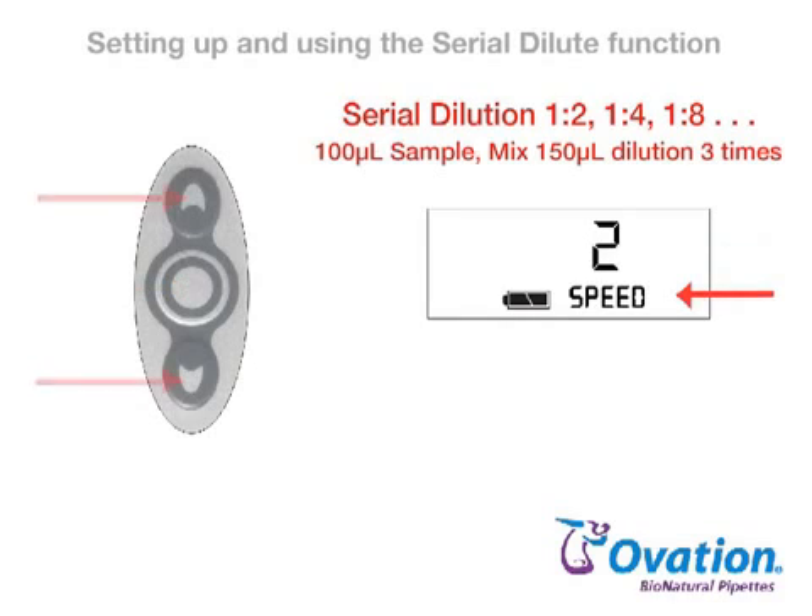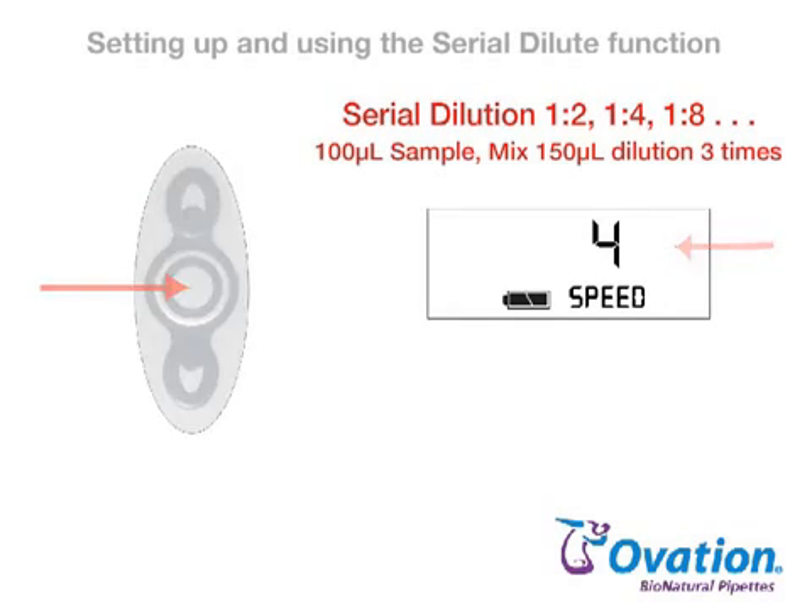Press and release the up or down arrow until the desired speed setting is displayed. One is the slowest, five is the fastest. Press and release the center button to lock in the speed setting and exit setup.